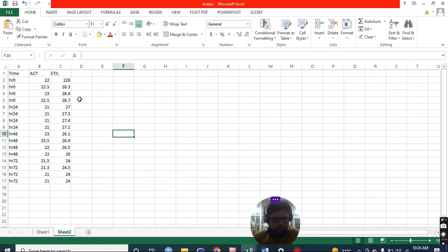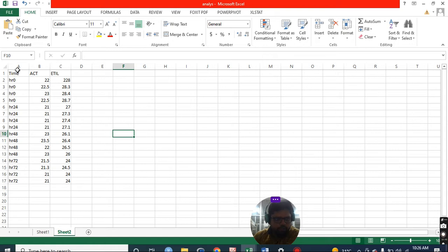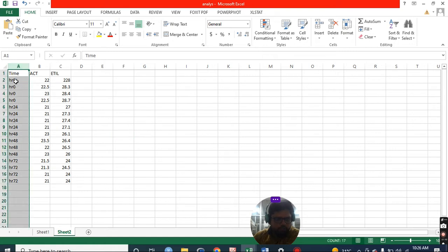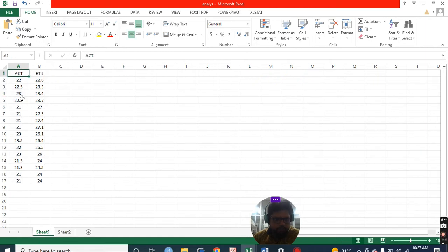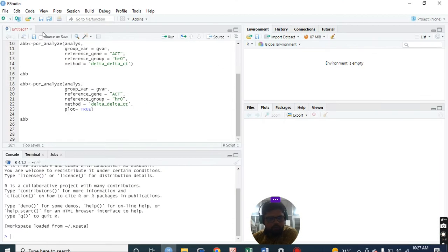So this is the CT values, and we need to remove this while feeding it to the R Studio. Every sample has four technical replicates. This is the file name; I am going to open R Studio. I have done this.